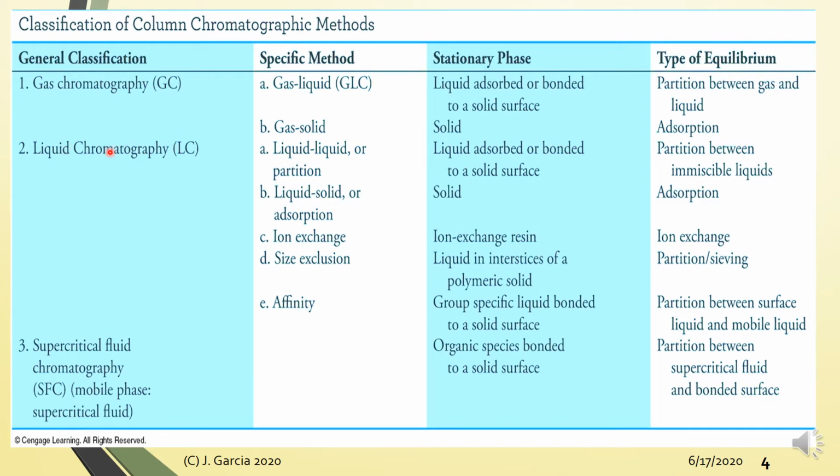Okay, so one advantage of liquid chromatography is you have this diversity of methods based on the equal diversity of equilibria that can be played around with, no, in liquid chromatography. So first, you have your liquid chromatography, wherein you have a liquid stationary phase. So basically, this is partitioning, no? So again, very much related to your distribution equilibria for solvent-solvent extraction, yung concept.